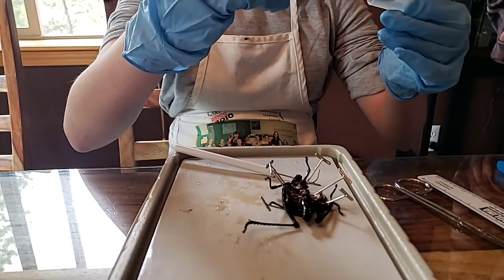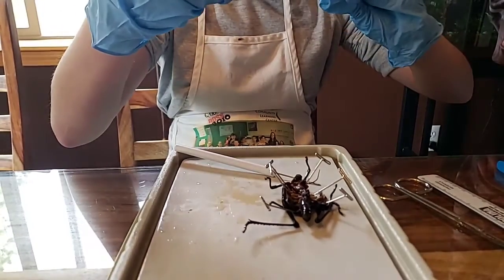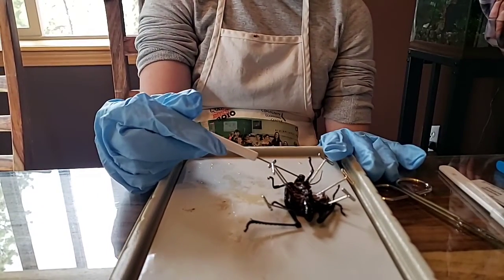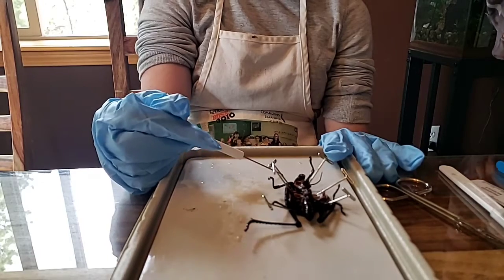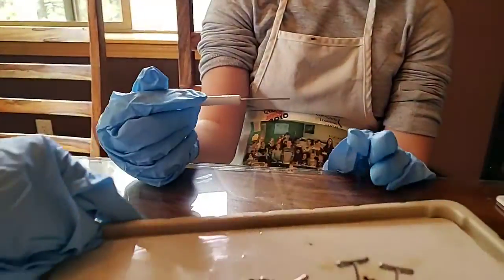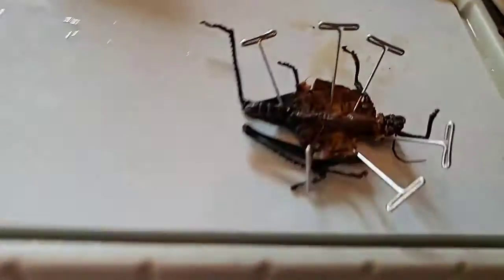All right, so Tanley, Lanston, as you look at your form, the esophagus comes right down underneath the crop. So it would be behind the crop. You're not going to see it very well unless you gently move it out of the way, but it's going to be a hard thing to get to. Okay, so that big round part. Let's see if we can turn this a little bit more. This is super hard. Okay, I'm just going to hold this over it then.